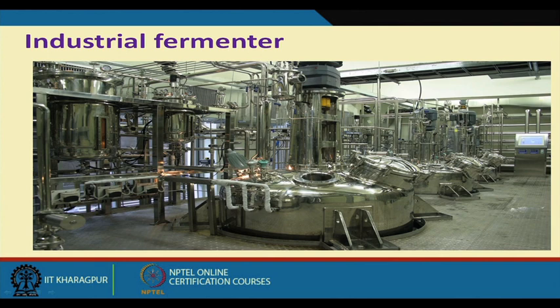If we directly apply this power to the shaft, we can imagine the agitation speed will be tremendously high. So what we do is first put the power into the gearbox. In the gearbox we reduce the speed stepwise, and ultimately whatever speed we want, we transfer to this particular shaft. The whole gearbox is usually submerged in an oil tank.